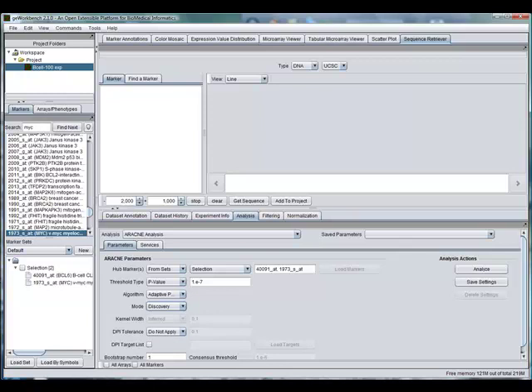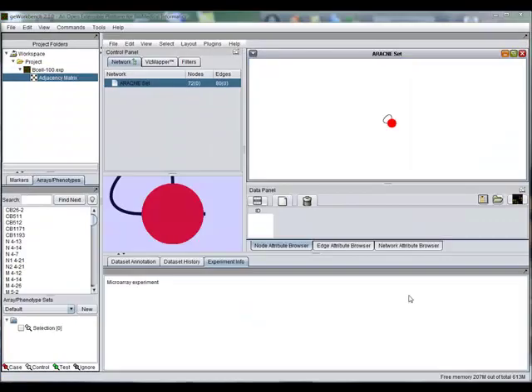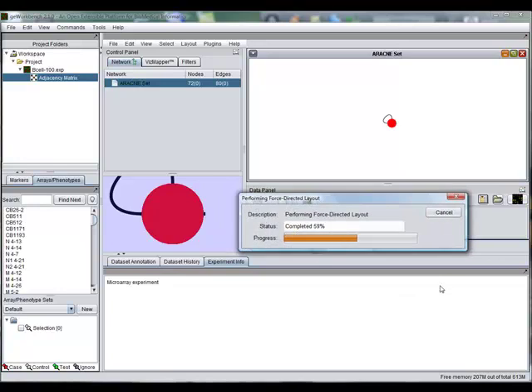There is a DPI. As we mentioned in the introduction, data processing inequality analysis removes indirect interactions. For this illustration, we're not going to apply this analysis. So now all the basic parameters that we need to run ARACNe are set, we just need to click on Analyze to run ARACNe.